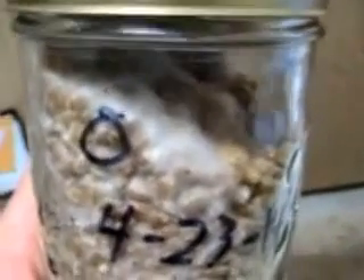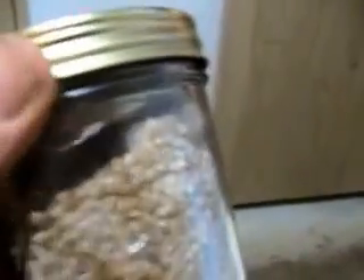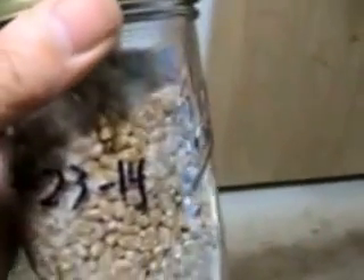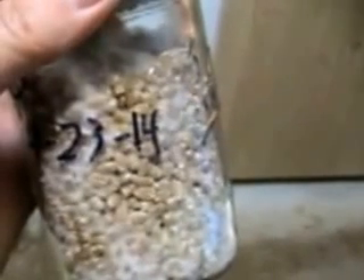Here we are just ten days later. As you can see, the mycelium has spread through most of the grain in the jar. In a few more days this will be ready to use as spawn in a growing medium, a substrate like straw. That's how you create spawn from mushroom bits for use in growing mushrooms out to fruit.